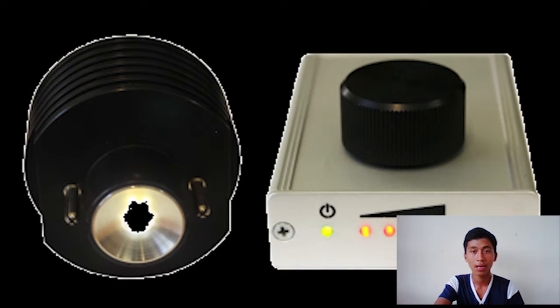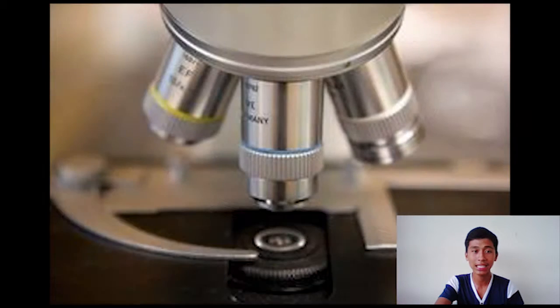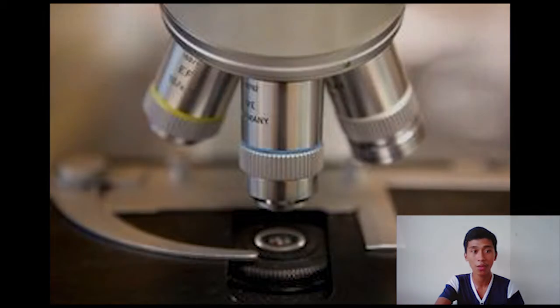Then is the illuminator. This is a steady light source, usually 110 volts, used in place of a mirror. And then the stage, the platform where you place your slide, and stage clips hold the slide in place. Next is the revolving nosepiece, sometimes called the turret. This is the part that holds two or more objective lenses and can be rotated to easily change power. And then the objective lenses; usually you will find 3 or more objective lenses on a microscope. The rack stop is an adjustment that determines how close the objective lens can get to the slide.